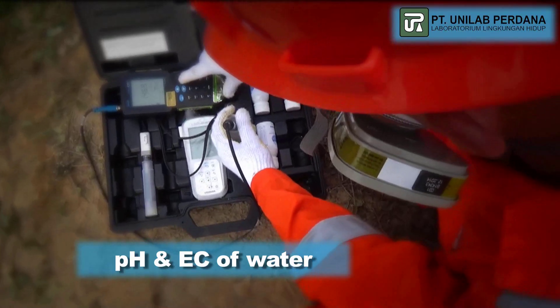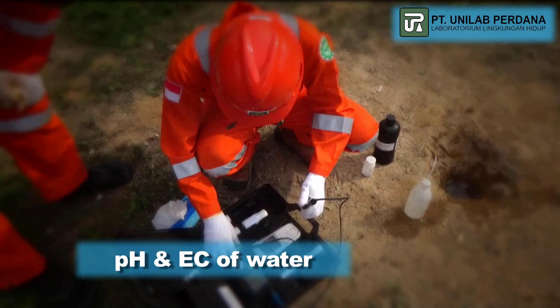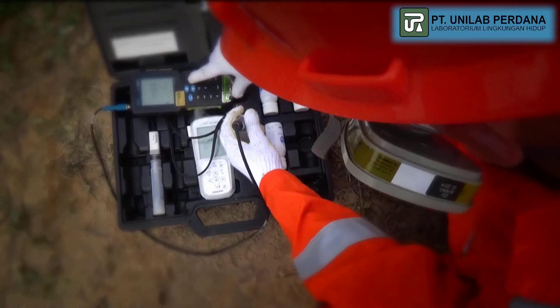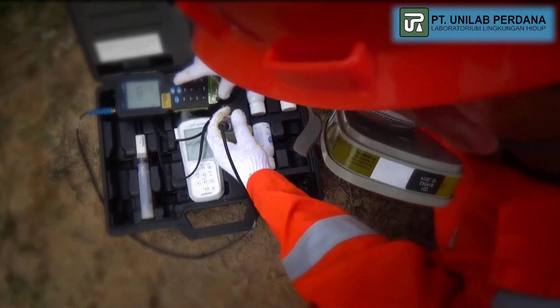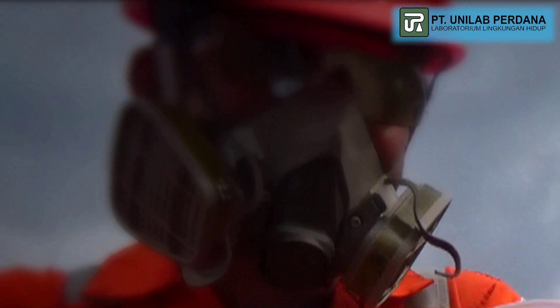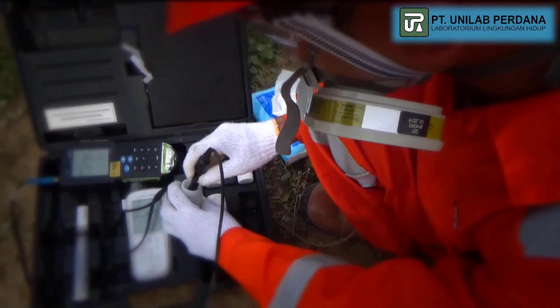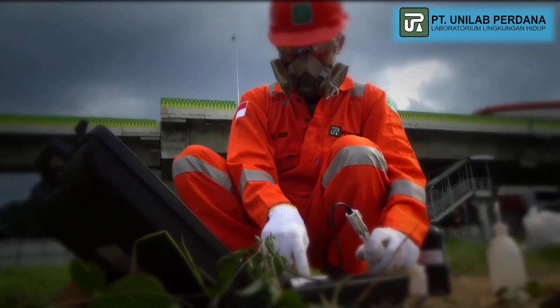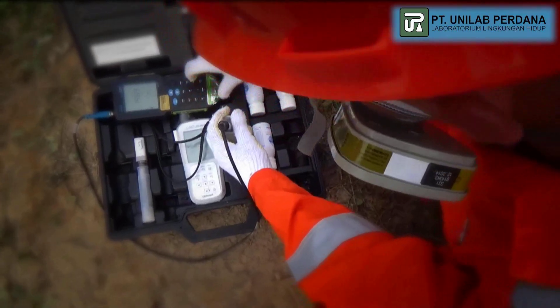This method involves conducting electrical conductivity tests on a water sample using a conductivity meter. Electrical conductivity is measured by conducting electrodes using potassium chloride solution as the standard solution. A high result of electrical conductivity indicates the accumulation of large dissolved salts.